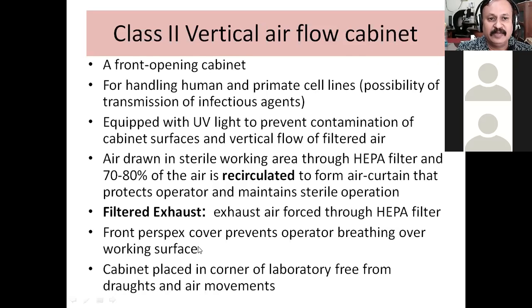Okay. Sure, sir. So then we will see what are the important features of the class 2 vertical airflow cabinet. It is again a front opening cabinet, but the flow of air is from top to down, top to the working surface. It is useful for handling human and primate cell lines because there is a possibility that the material may contain infectious agents which will infect human beings. And therefore we are going to use this kind of a laminar airflow cabinet.